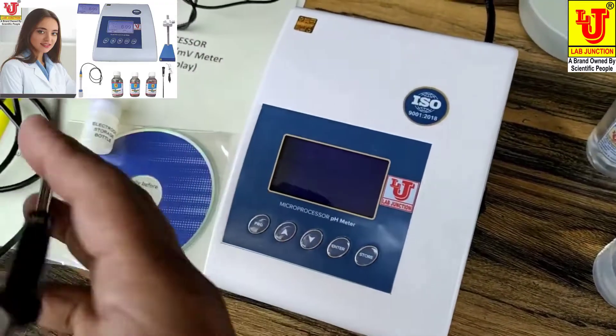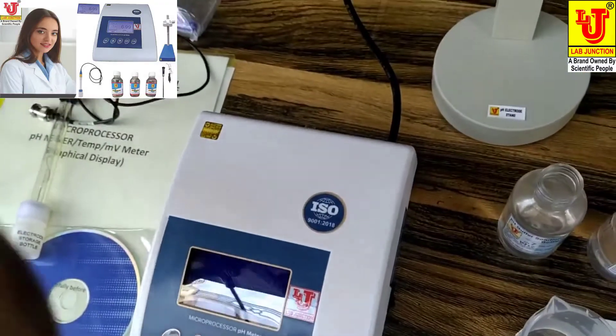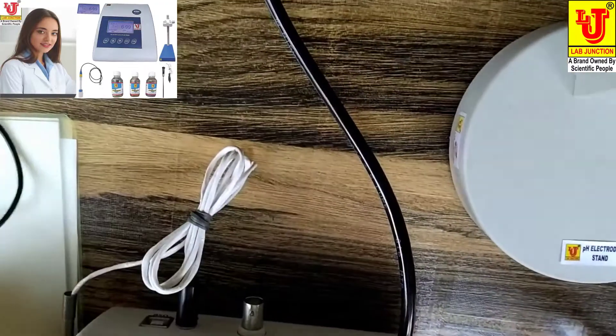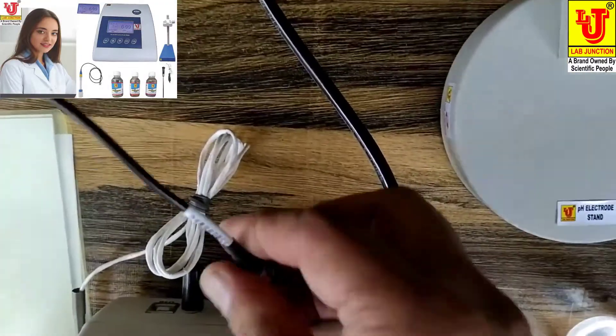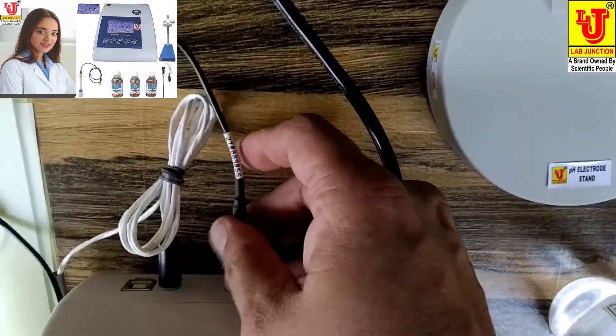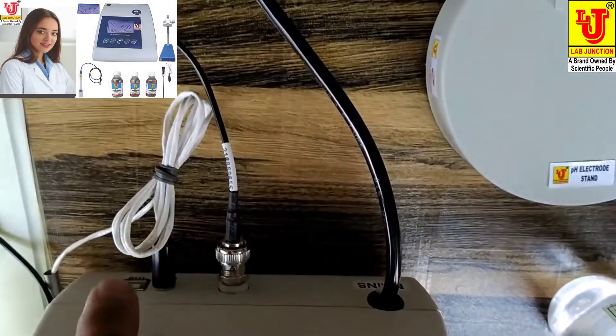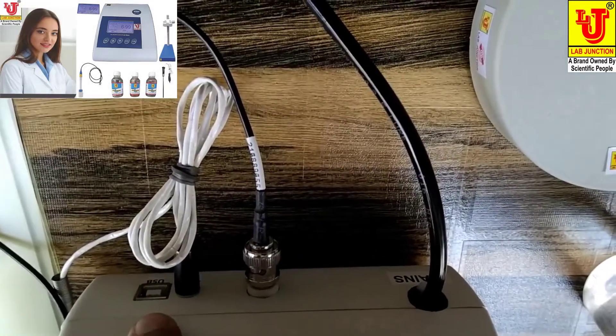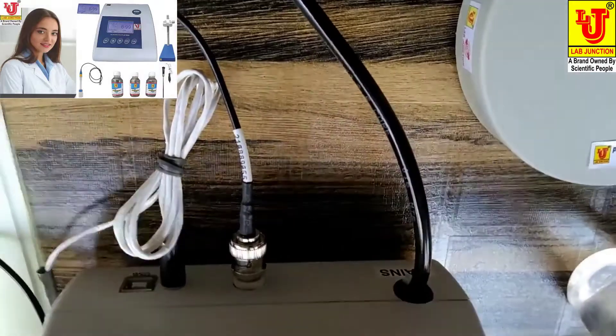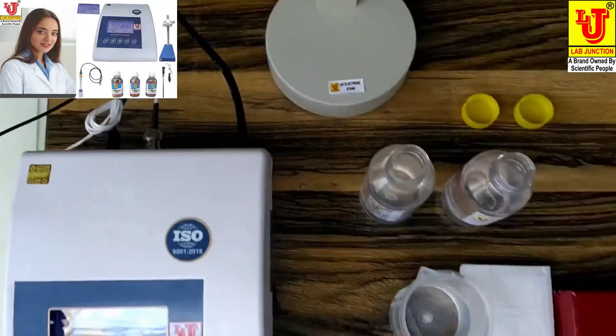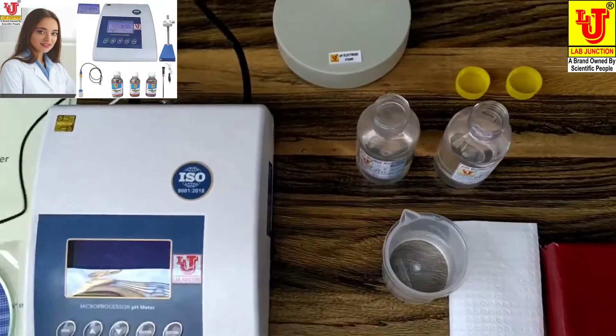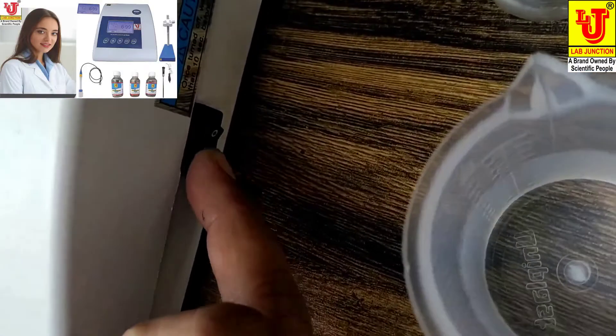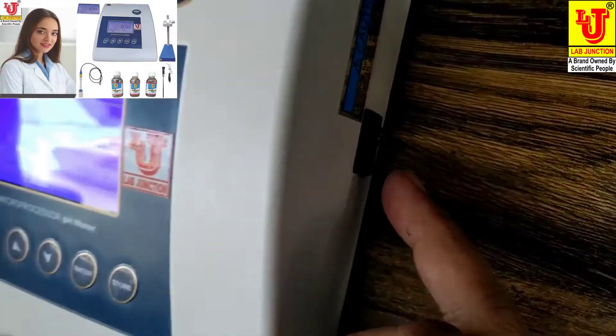First I have to mount the temperature sensor to the pH meter and pH electrode to the pH meter. This slot is for USB interfacing with PC attachment, and this is the main cord. And this side of the pH meter, there is an on-off switch. You can switch it on like this.